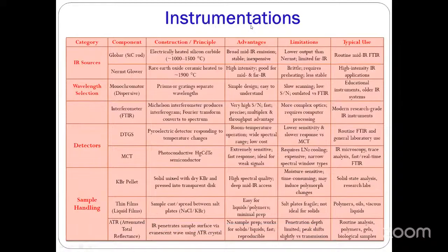Dear research scholars, can you point out the limitation? Okay, I will tell you. As we are mixing solid sample with the KBR, we can analyze only solid samples. Another important thing, the KBR should be dry.